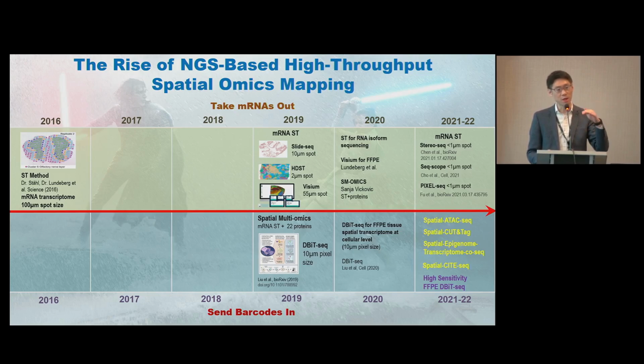And afterwards, you do on-glass slide cDNA synthesis. You're going to incorporate those spatial address codes into your cDNA sequence. So that's how you can generate spatially encoded, or spatially identifiable, cDNA molecules from just one tissue sample, and you can resolve that later once you get all the cDNA collected and perform unsupervised, high throughput NGS sequencing. You can read where that spatial address code is and what that gene is. That's the fundamental principle. So I think many of you probably know that that has been commercialized by 10x Genomics as the Visium platform.